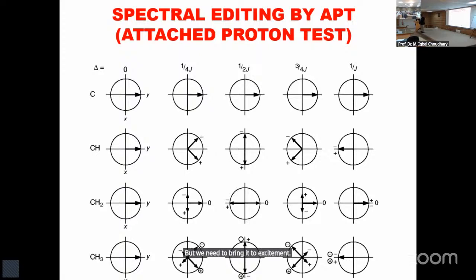Your detector, your little beautiful detector, is on Y. I made this beautiful eye, you remember? This was a piece of art. Don't show it to anyone. So this little detector is conventionally on Y.